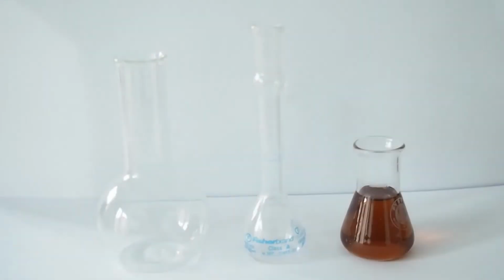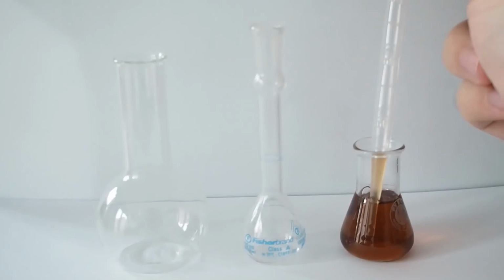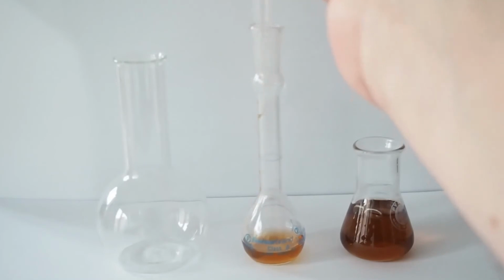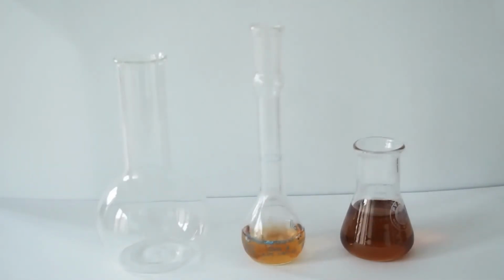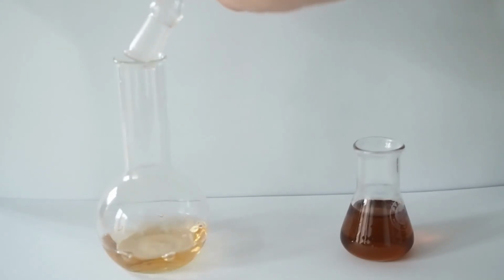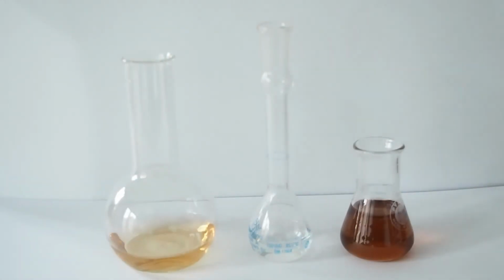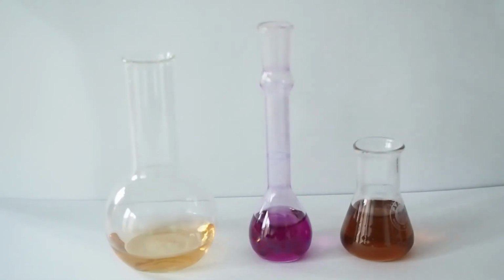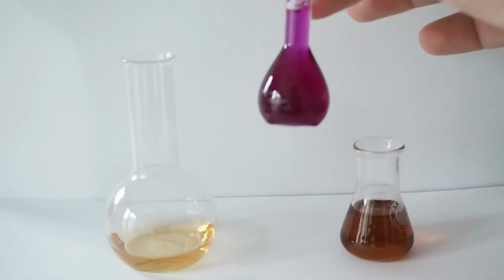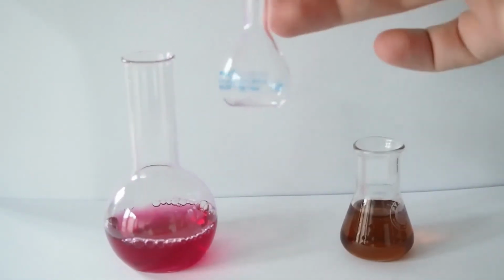Now I've got some malt vinegar here, but it's too concentrated as it is. So what I'm going to do is take 2 millilitres of it, put it into this volumetric flask, and then make it up to 10 millilitres. Oh, I overshot a little bit there. Oh dear. And then I'm going to put in 10 more millilitres, so we've diluted our vinegar by 2 millilitres into 20, and I'm adding the indicator into this second solution just to help make that up and have a really nice strong solution with the indicator in, so it's very, very clear to see what's going on.